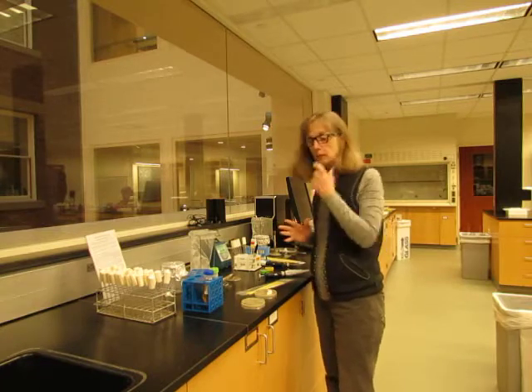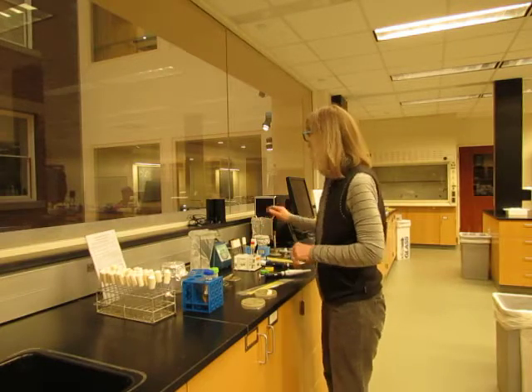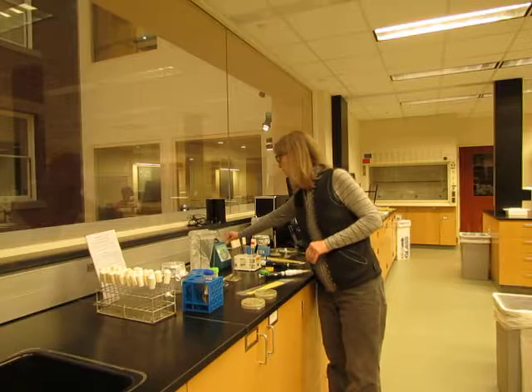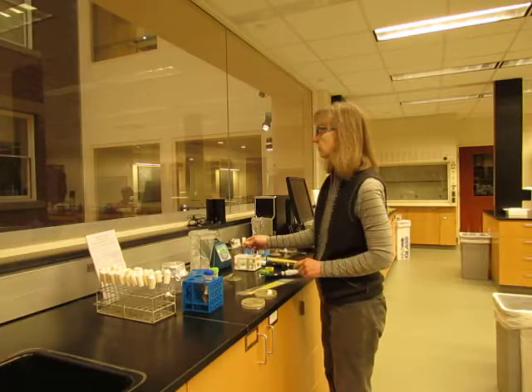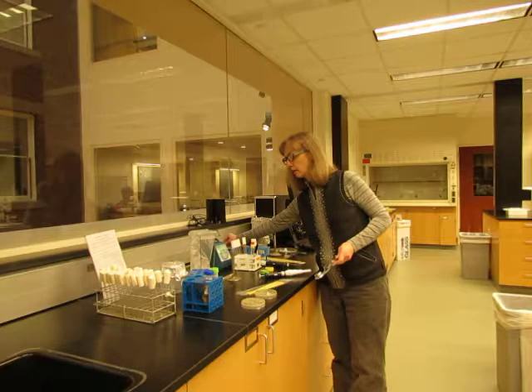In order to keep all of the components sterile in this process we're going to use a flame. To turn that on, I am going to turn the gas port 90 degrees from the off position and use a striker to start the flame. Then I'm going to turn the gas back a bit to lower the flame.